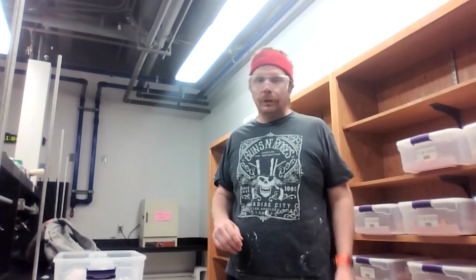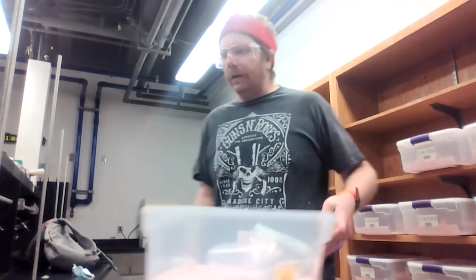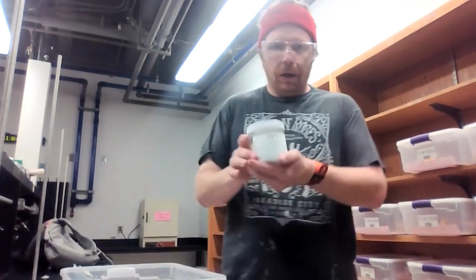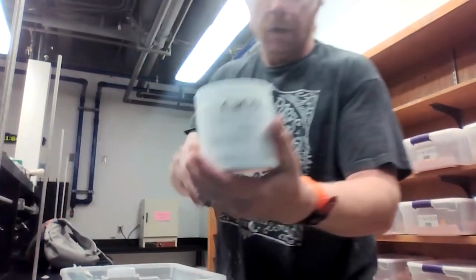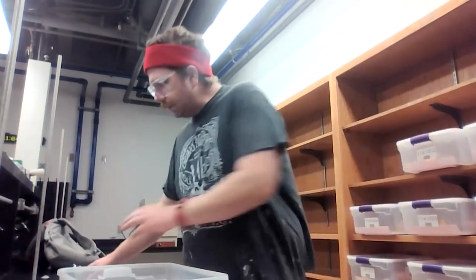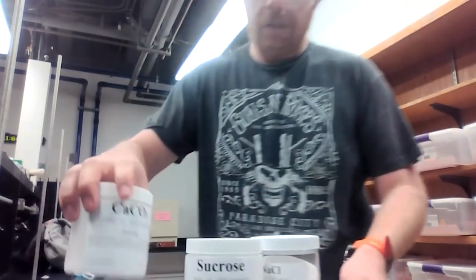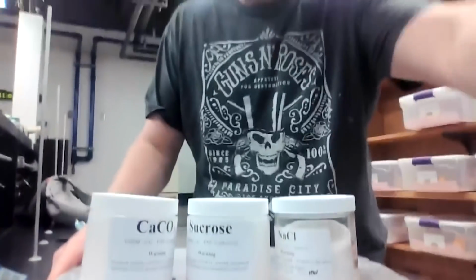I'm Dr. Gray. I'm going to be walking you through your experiment this week. Your experiment is one in which we're evaluating different solutions. We're evaluating a NaCl, a sodium chloride solution, a calcium carbonate solution, and a sucrose solution. Now, if you are in 1341, then you probably know this, but what is the difference between each one of these solutions? I'm going to go ahead and present them like this, and then I can change the camera.